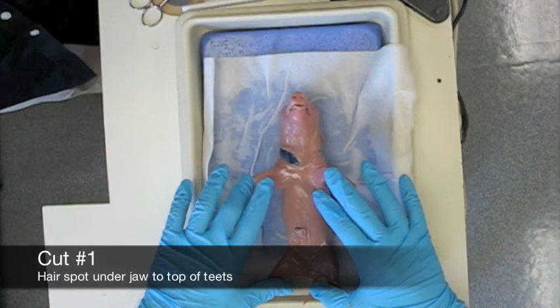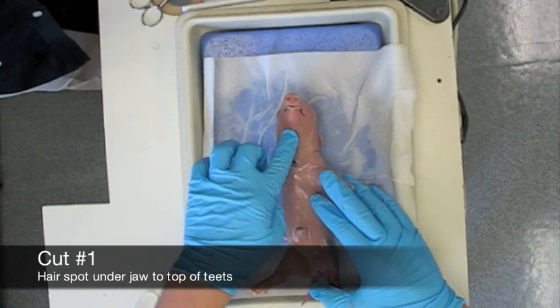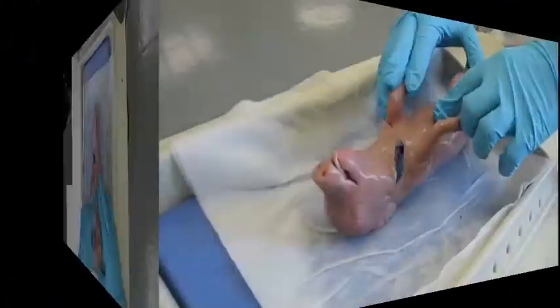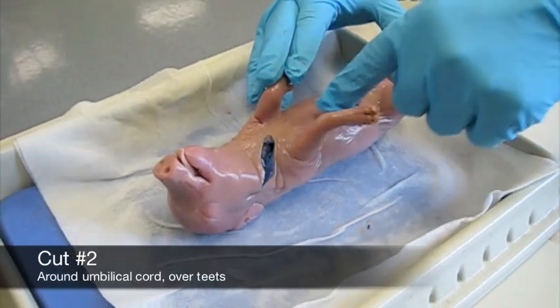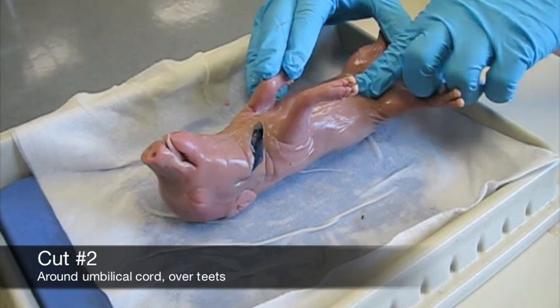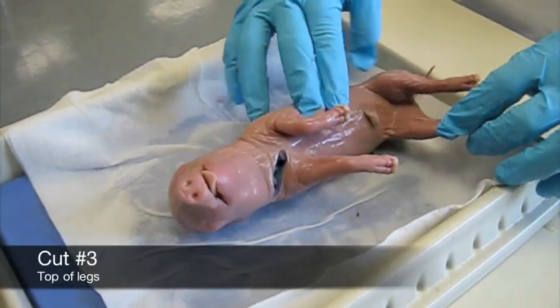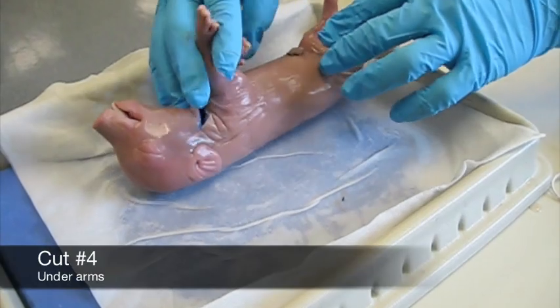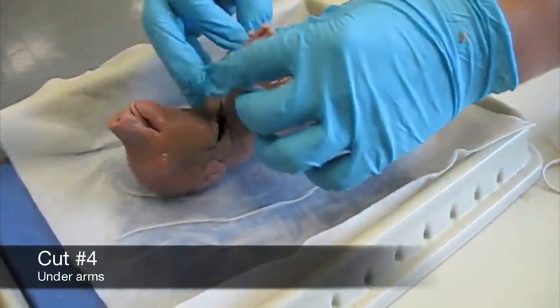When we start cutting into the animal, the first cut you are going to do is from the hair spot up here up to about the top of the teats. From there you are going to cut shallowly around the teats on each side and you are going to end up pulling back this tissue here to expose the underside of the umbilical cord. The next cuts you are going to make are going to be above the legs around here and under the arms around here.